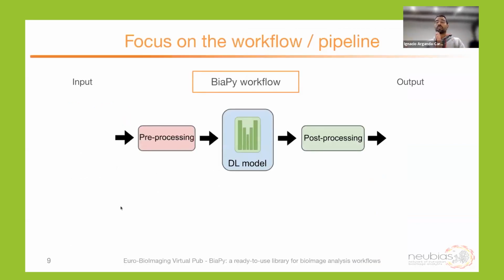Well, the whole focus of BiaPy is, as its name indicates, the workflow, right? Meaning, what do we understand by a workflow? Well, actually, we have three main components. Always at its core, we have a deep learning model.